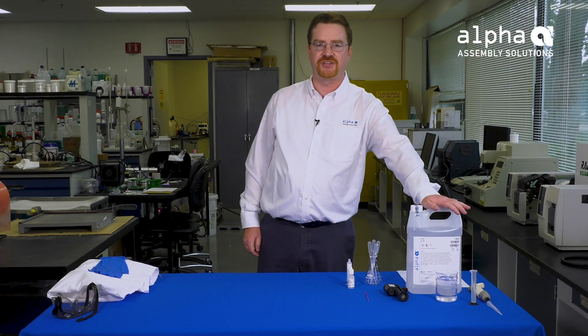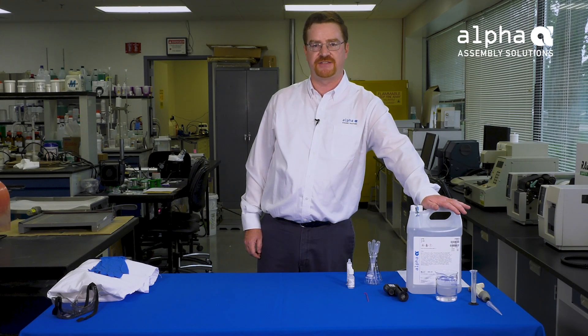Today, we are going to measure the acid number of SLS 65C liquid soldering flux. The safety data sheet recommends using eye protection and skin protection, so we will be wearing goggles and gloves for this procedure.